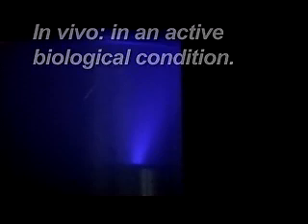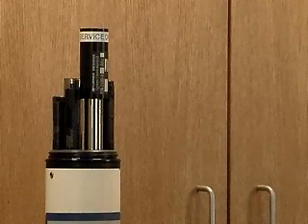Monitoring in vivo — that is, an active biological condition — is subject to a great deal of variability. The fluorescent properties of an algal population in a body of water can change with the health of the algae, temperature, and even the time of day. This makes in vivo measurements more useful for trending than for exact quantitative values.